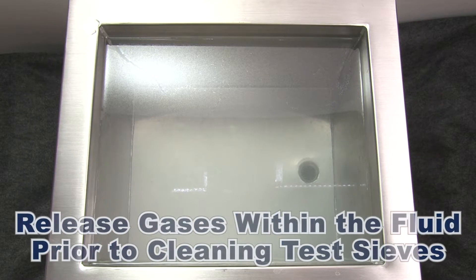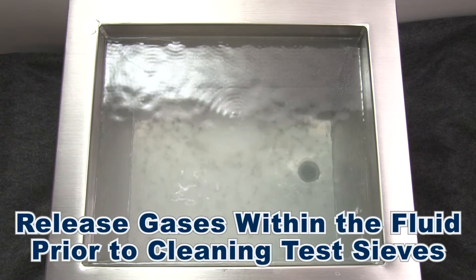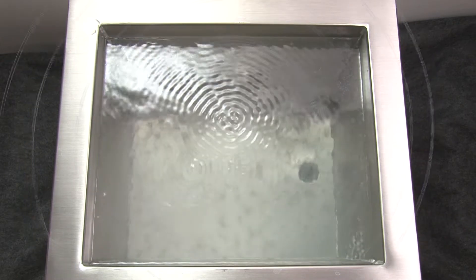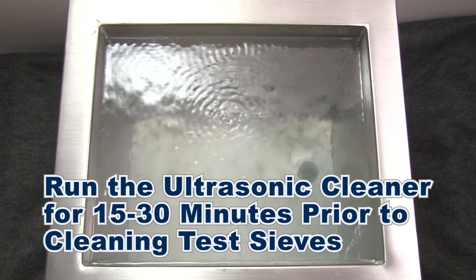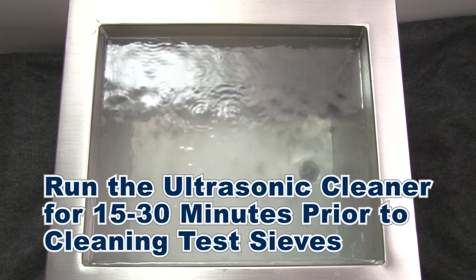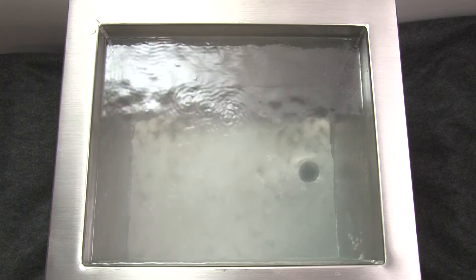It is also important to be aware of gases within the cleaning fluid. These gases can absorb ultrasonic energy and result in less effective ultrasonic cavitation. Therefore, it is a good idea to run the ultrasonic cleaning unit for 15 to 30 minutes prior to the cleaning operation to force these gases out of the cleaning fluid for maximum cavitation success.